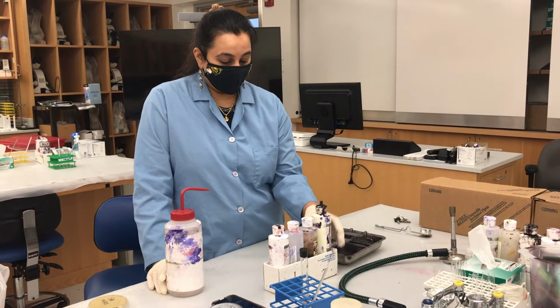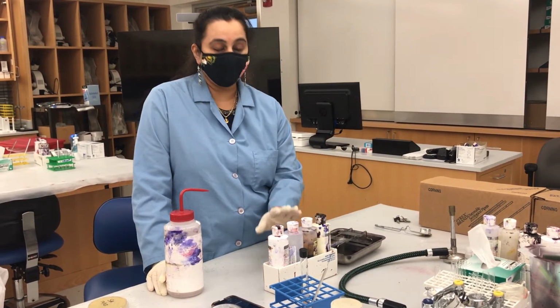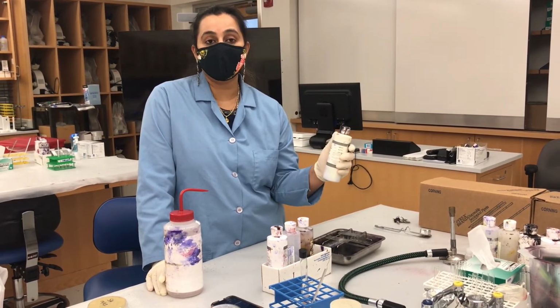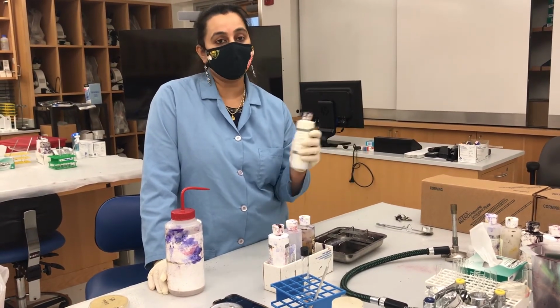Before I begin, I would like to say a few things about why we are adding certain reagents here. So what's the purpose of adding the primary stain? The primary stain is crystal violet. It's a basic stain, and it can stain any cell, any bacterial cell.